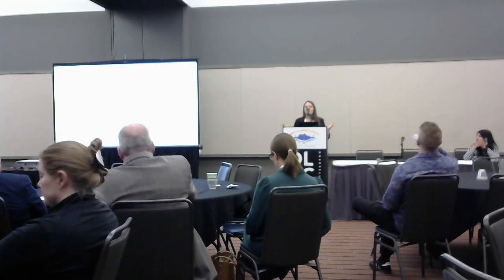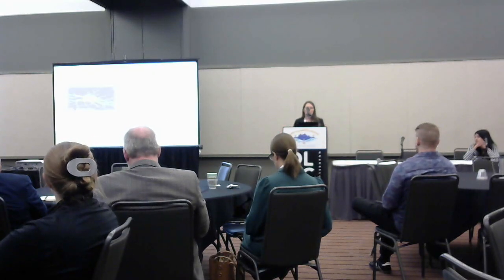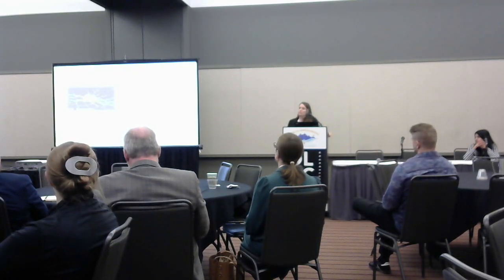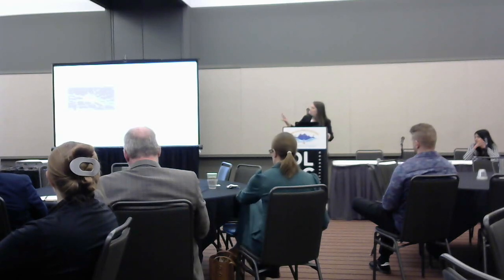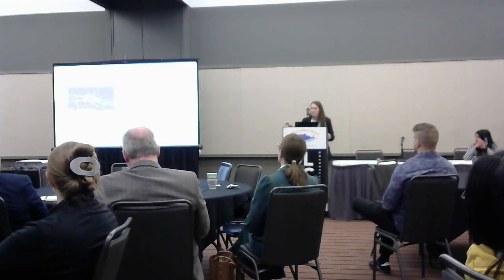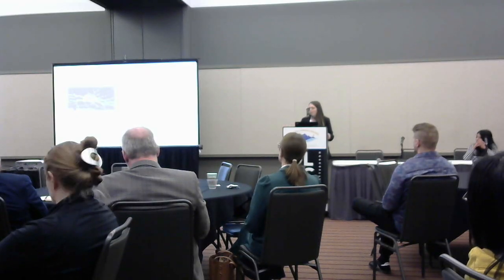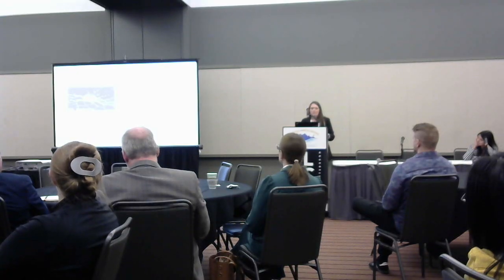First, what software does the required task? So to be specific, to use a specific example, segmentation of 3D objects, which can be challenging. Here you see a three-dimensional neuron in culture with a fluorescently labeled Golgi and mitochondria. If we wanted to segment those things, how do we do so? What's the best software? Things to consider.